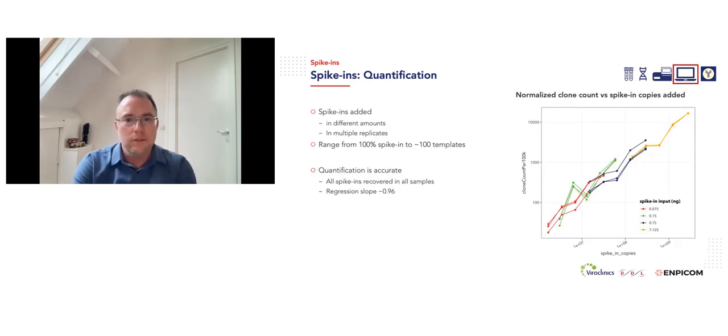So for the different concentrations of spike-ins, first the twofold changes. We spike these in a few different fractions, so different amounts of nanograms as compared to the original sample. This is done in a PBMC background.